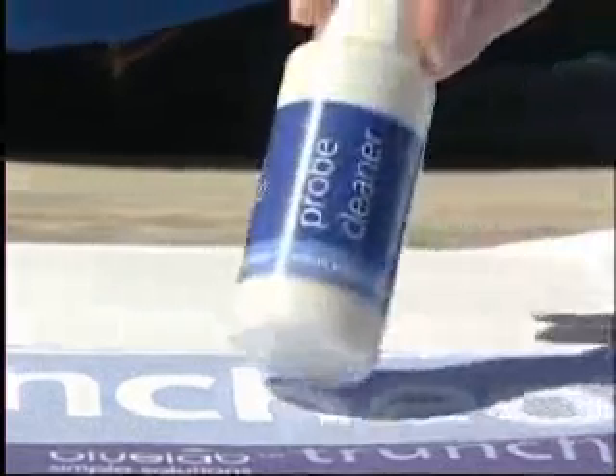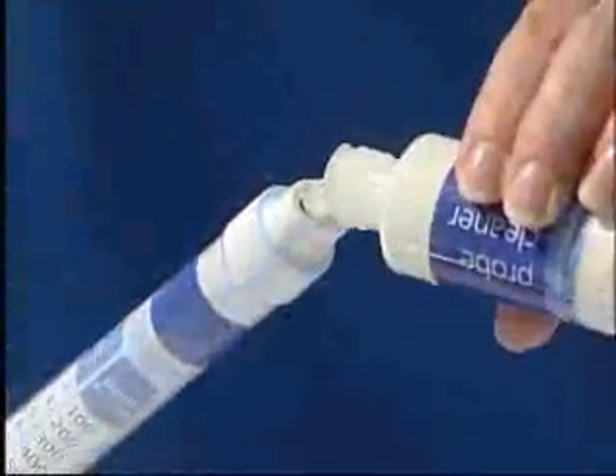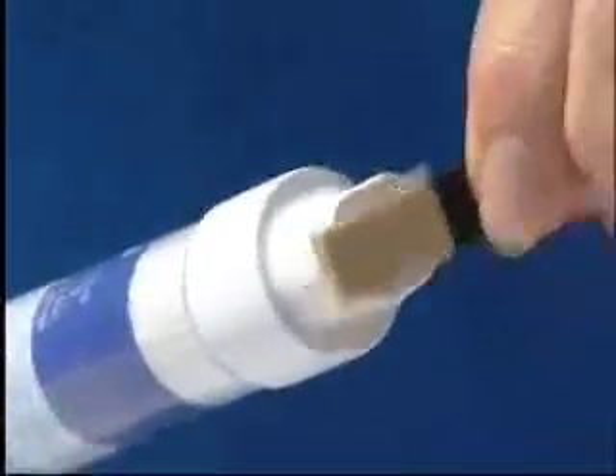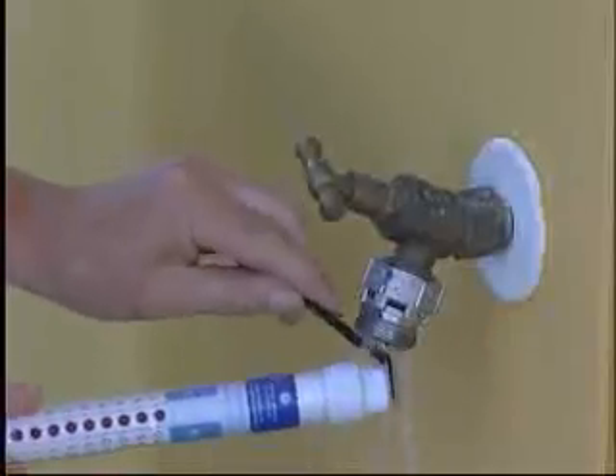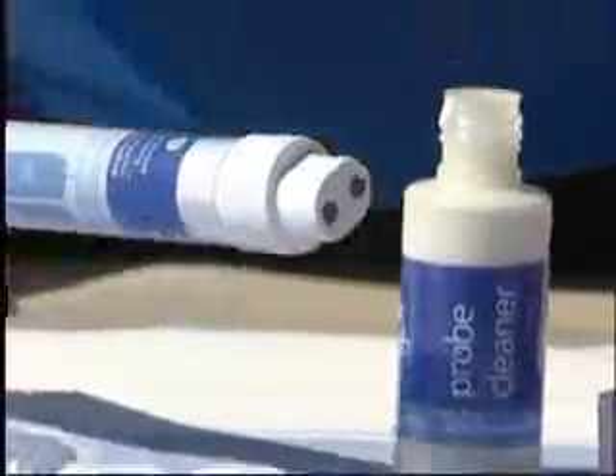Place some Bluelab probe cleaner onto the probe face. Use the Bluelab chamois to scrub the probe for about 10 seconds. Then rinse the probe well under running water. Replace the shroud, pushing firmly. Simple.